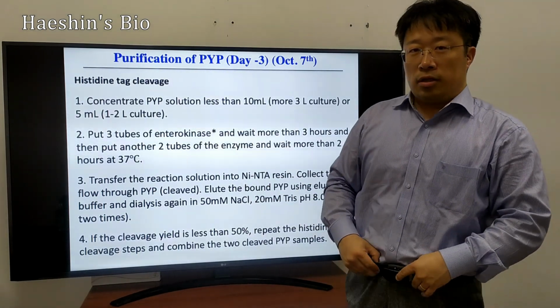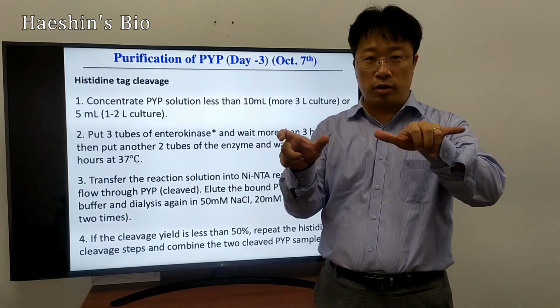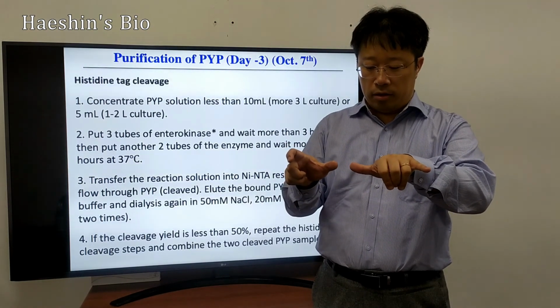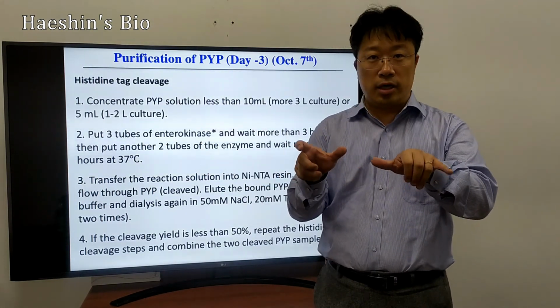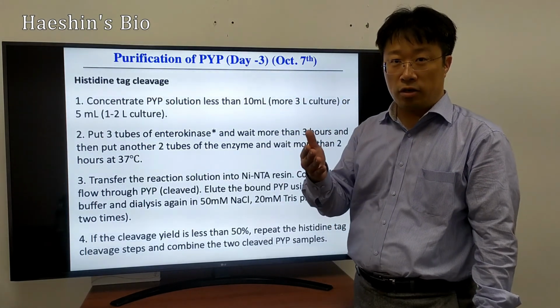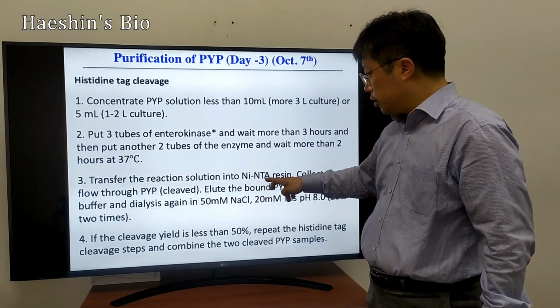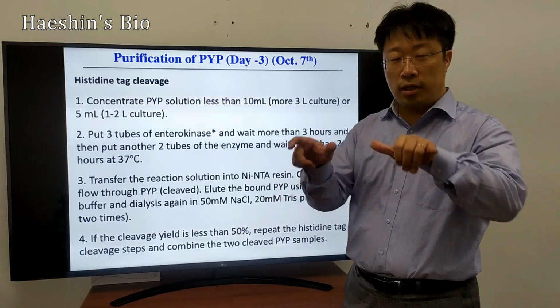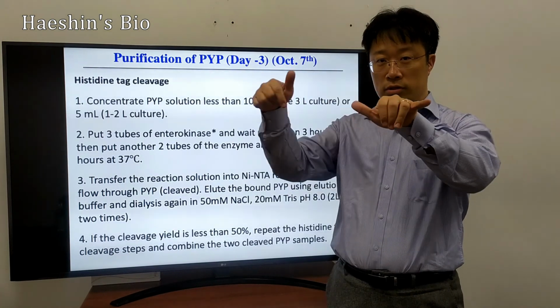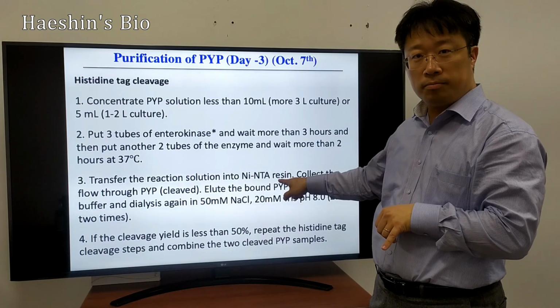But now you have to think about two things. If this enterokinase reaction is only partly working, say you have 100 molecules of this protein and the enterokinase may be 90% cleaved, but still you have 10% uncleaved. So you have to purify it again, right? It's easy, because if you use another nickel NTA affinity resin, you can easily purify, because the uncleaved, total-length protein will bind again to this column.